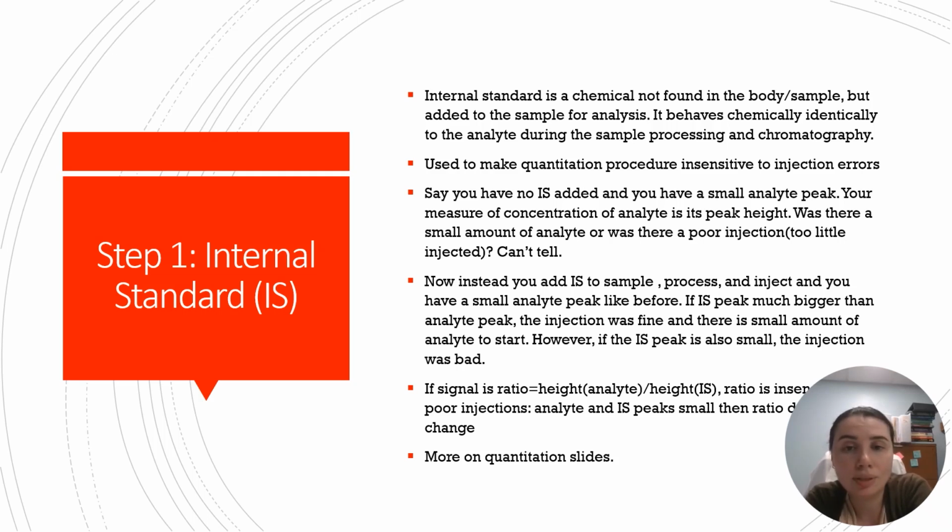It can also make your quantitation procedure insensitive to injection errors. So for instance, if you have no internal standard and you have a small analyte peak, you don't really know if it's small because there is little analyte in your sample, or because there might have been a bubble or some other type of injection error.